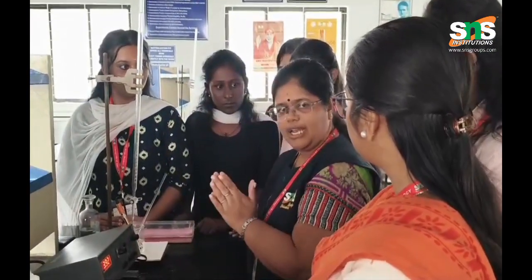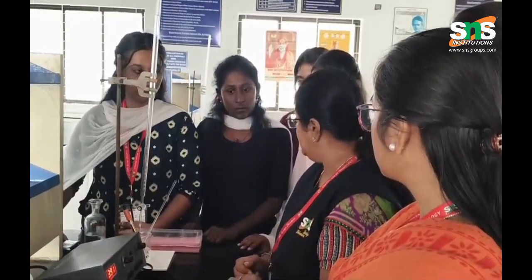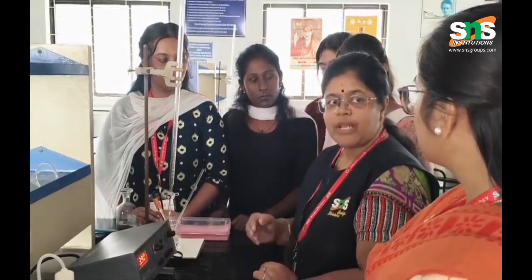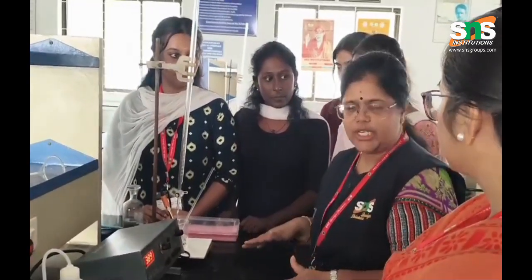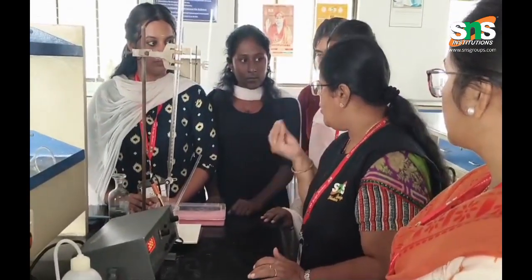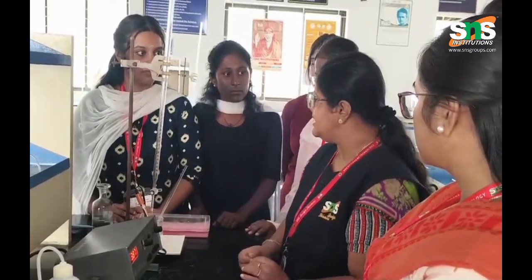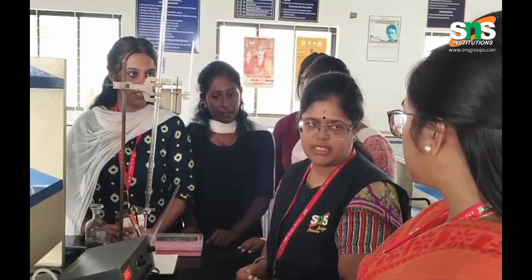After the end point, when all the acid is neutralized, you will have a sudden increase in conductance. That is due to the excess of OH minus ions in the solution as you keep adding the base, due to the movement of OH minus ions.